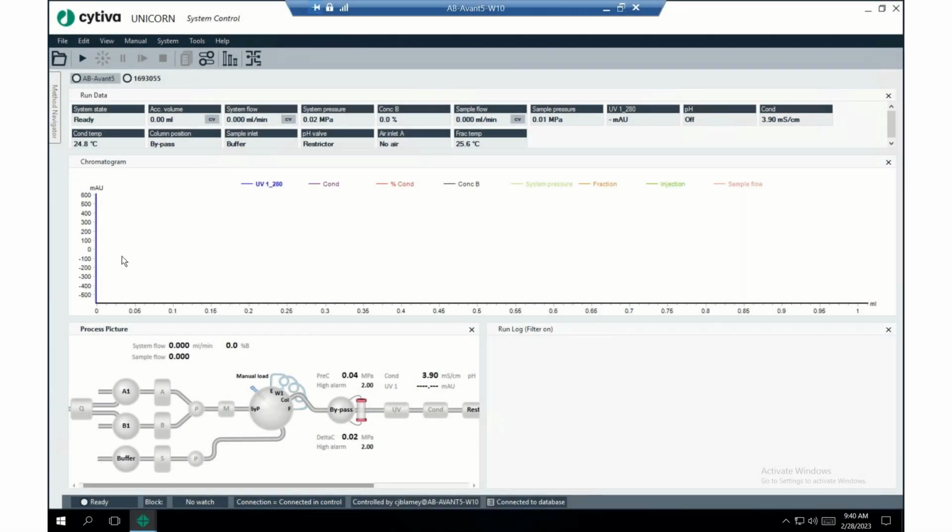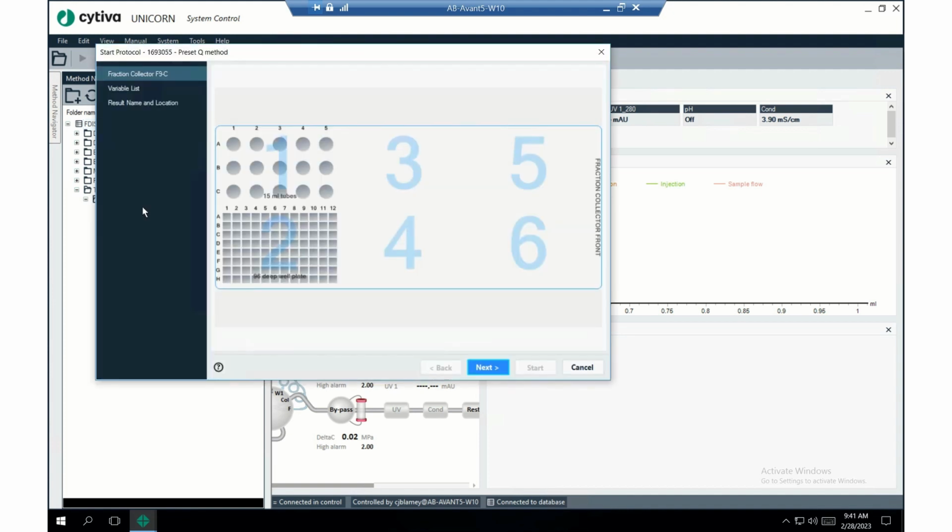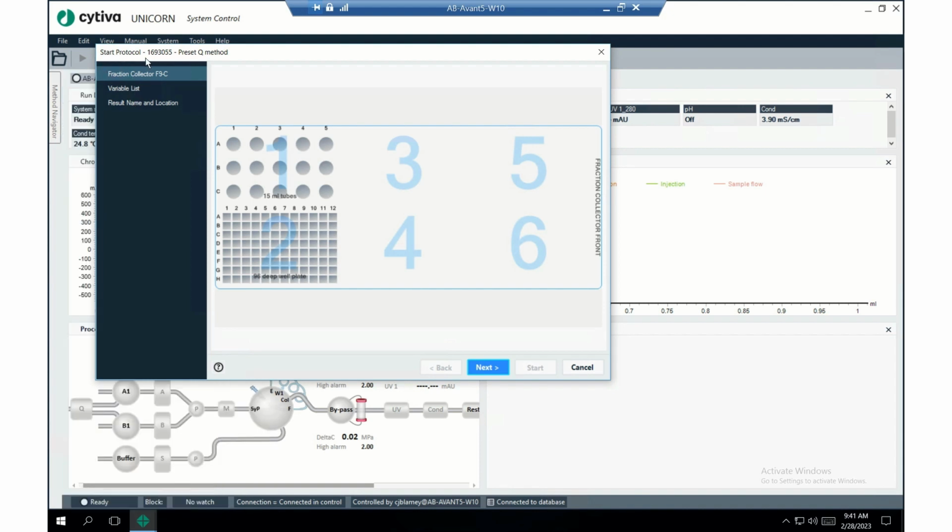In order to do this, we're going to go to the method navigator, and we're going to go to our training folder, and we're going to select the method that we just wrote. You can right click or you can just double click. So on the left are the 3 setup windows we need to work our way through in the setup protocol.